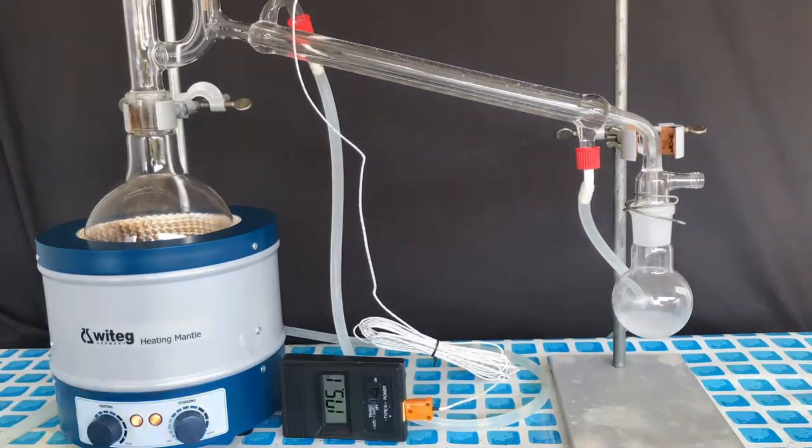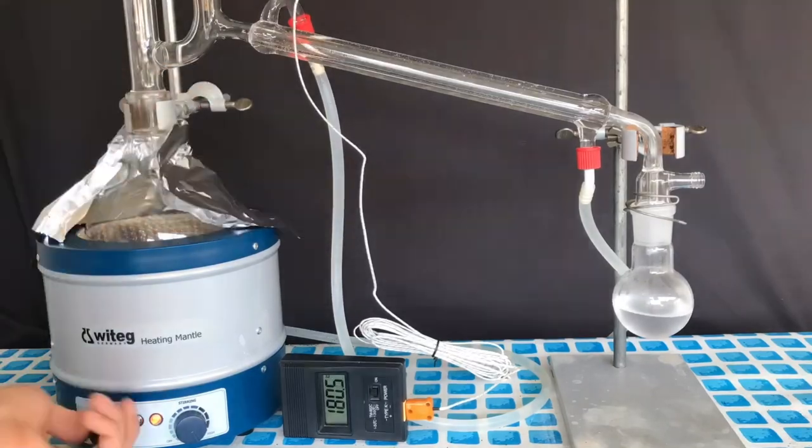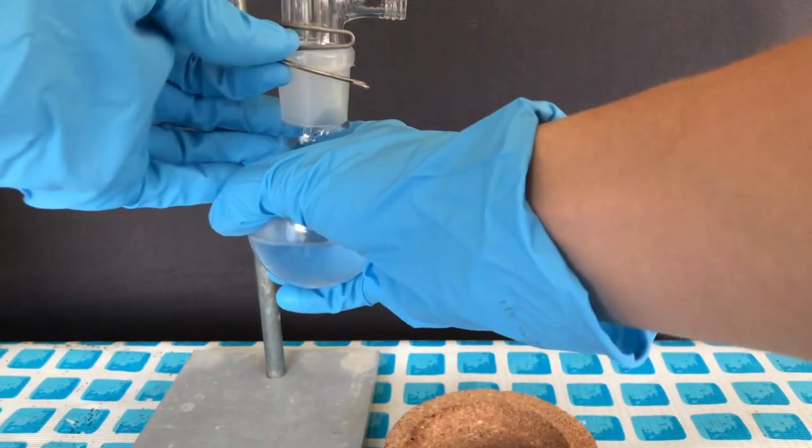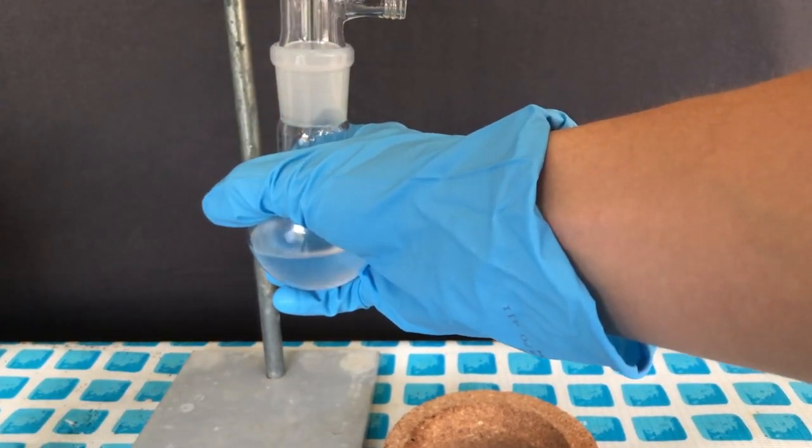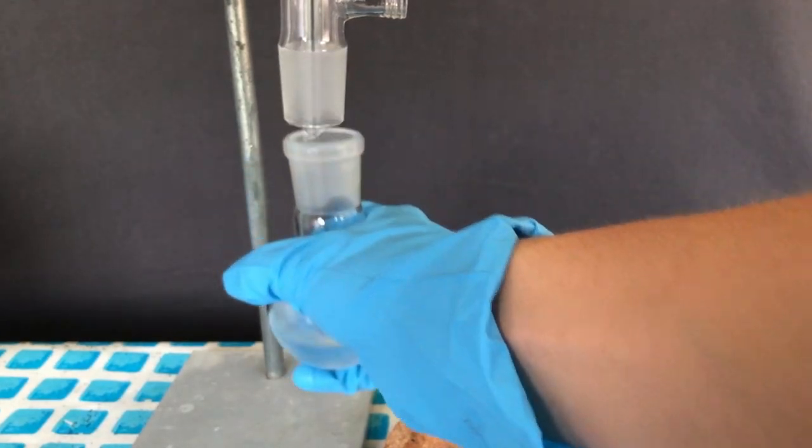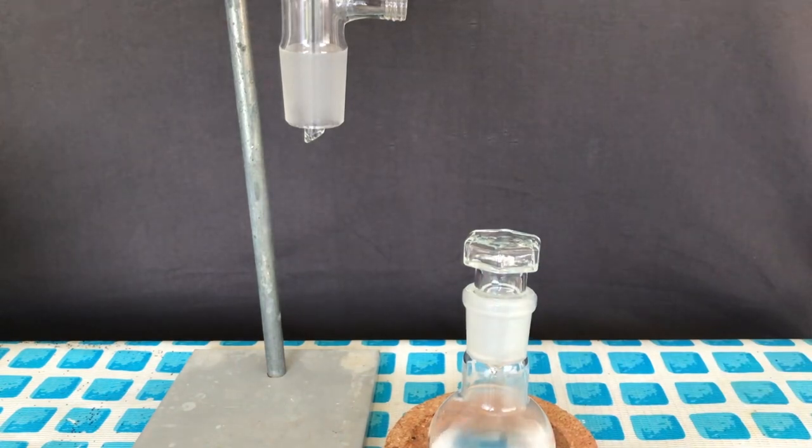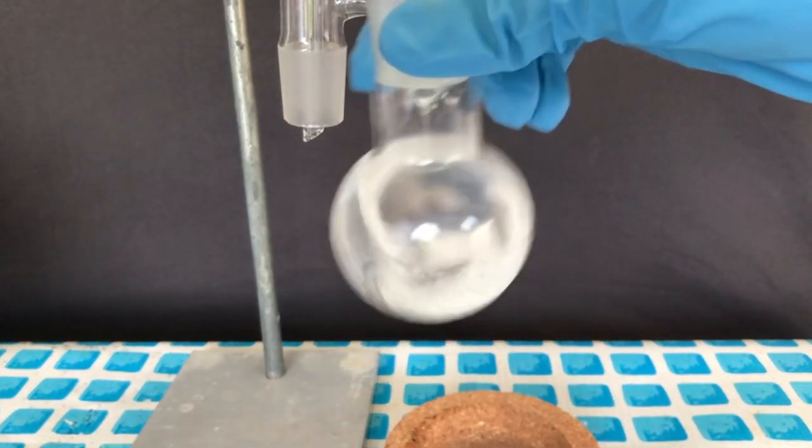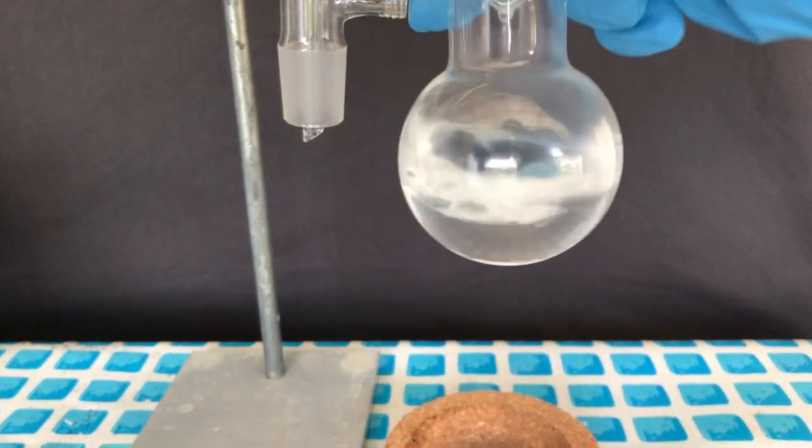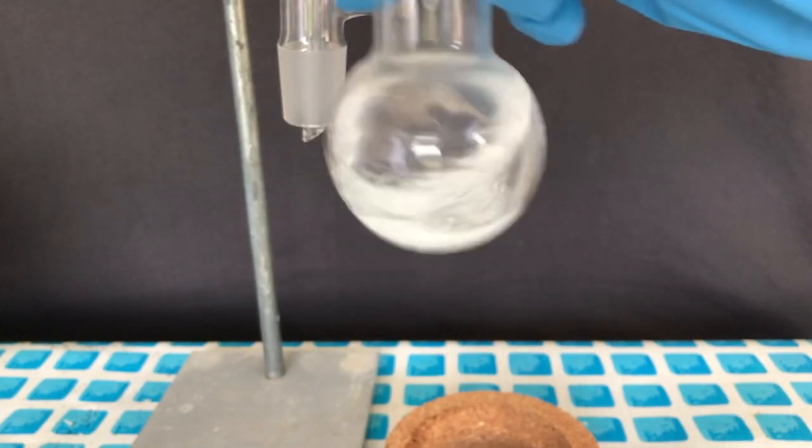The benzyl chloride coming over still contained some water as it looks a little opaque. This can easily be fixed though. After disconnecting the receiving flask, anhydrous calcium chloride was added as a drying agent and the product obviously cleared up. All the water has now been removed as indicated by the perfect clearness of the benzyl chloride.